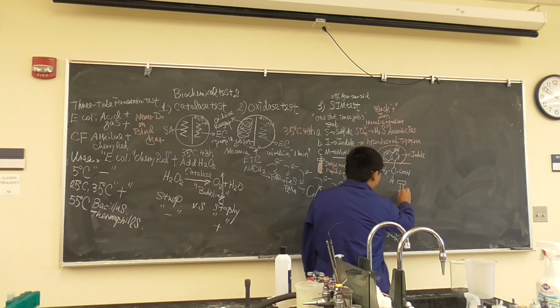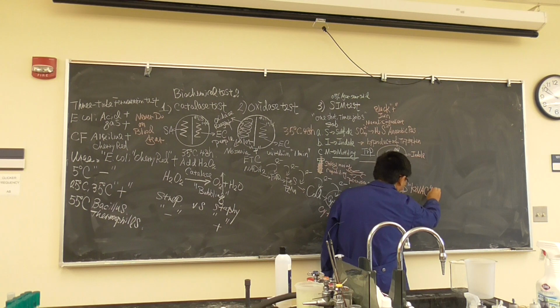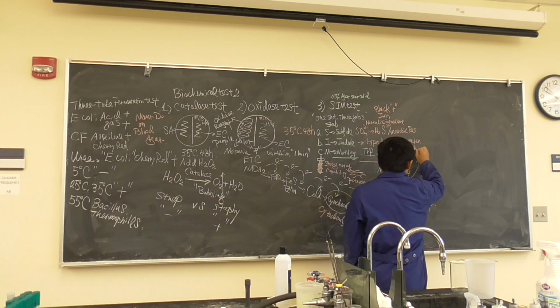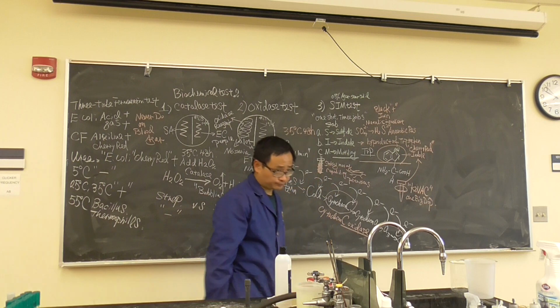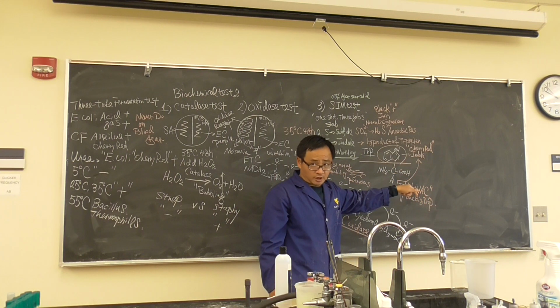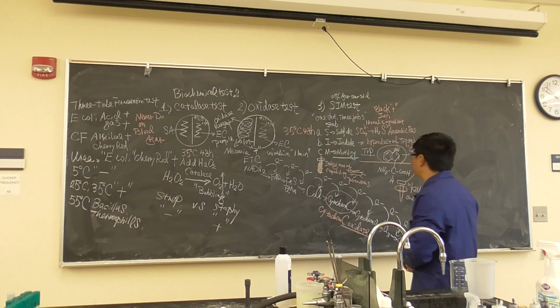Next week, Thursday, we're going to add one big drop of a reagent called Kovac's. A reagent, okay? One big drop. That tells whether it is indole or not. If it is cherry red on the top, it is indole test positive. This test, we will do an assigned culture. Okay, so that's SIM test.